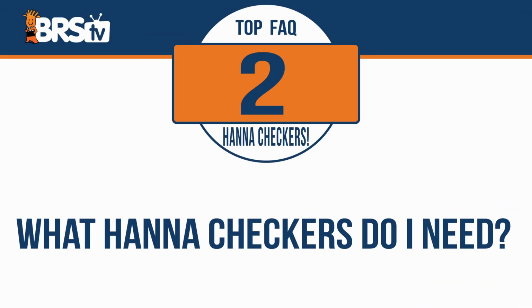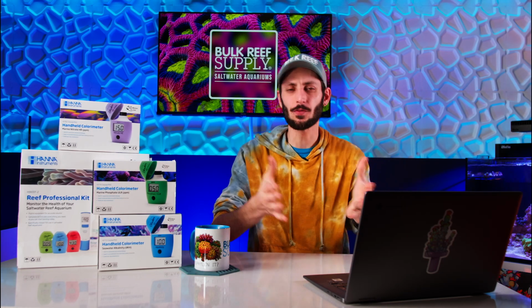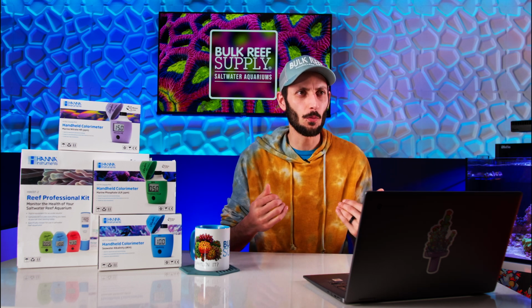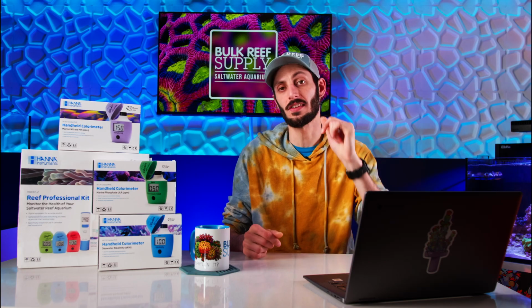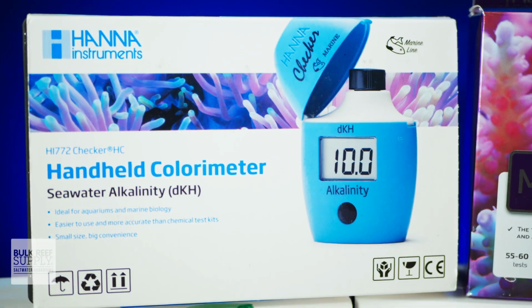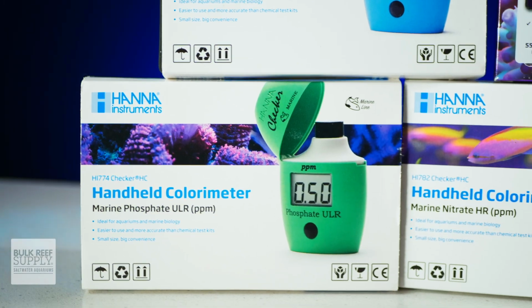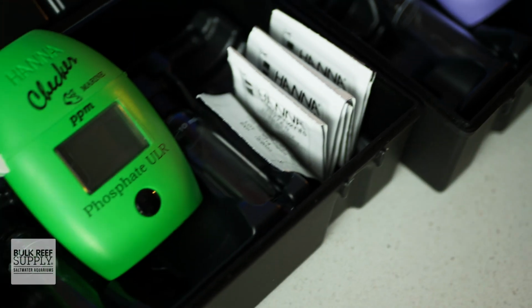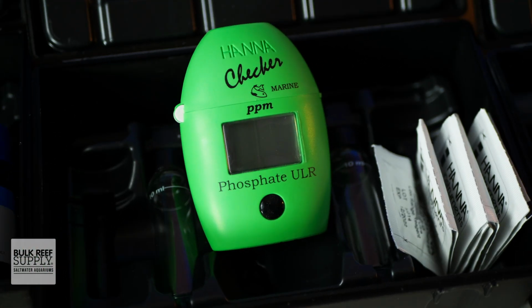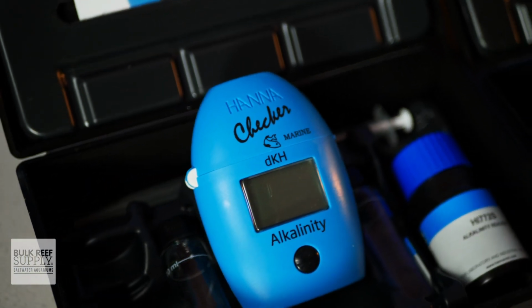What Hanna checkers do I need? Well, this really depends on what you personally test for on a regular basis, but with the majority of reefers in mind, I think the must-have checkers are the alkalinity DKH, nitrate high range, and phosphate ultra low range. They are the ones that you'll use most often, plus they all use a single reagent and are quick and easy to perform. They're the ones that I use and I do really like and recommend them. I'll link you to them at the end of the video.